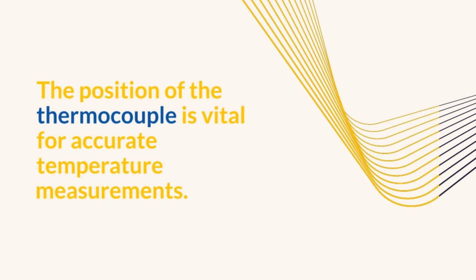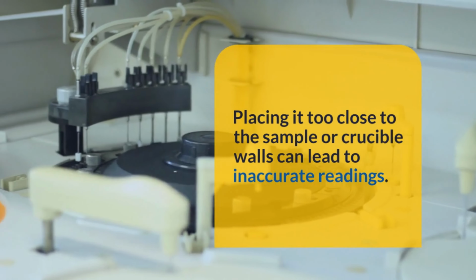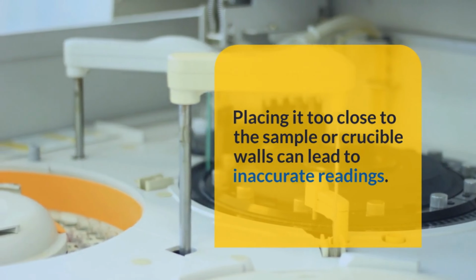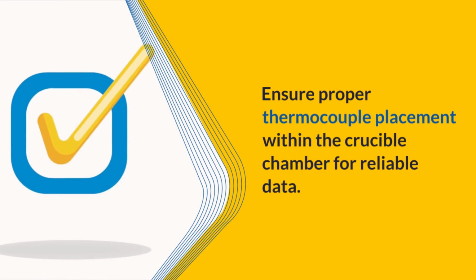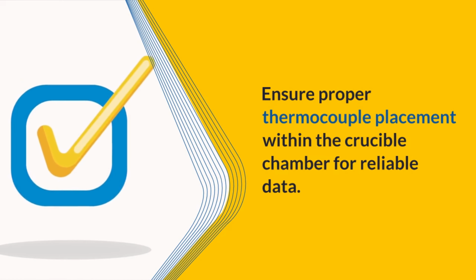The position of the thermocouple is vital for accurate temperature measurements. Placing the thermocouple too close to the sample or the crucible walls can lead to inaccurate temperature readings. Ensuring the thermocouple is appropriately positioned within the crucible chamber enhances the reliability of the obtained data.